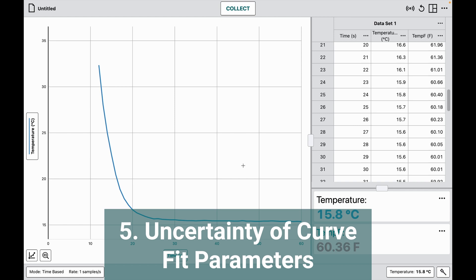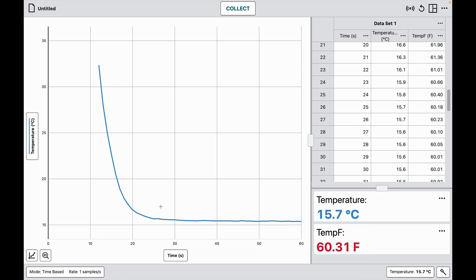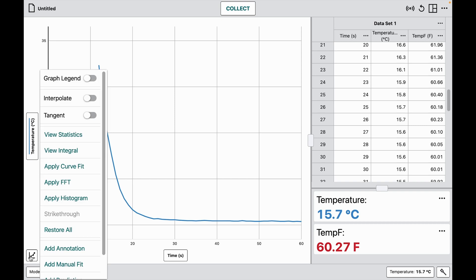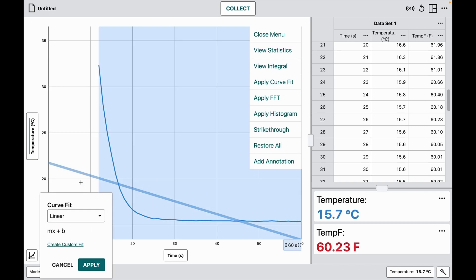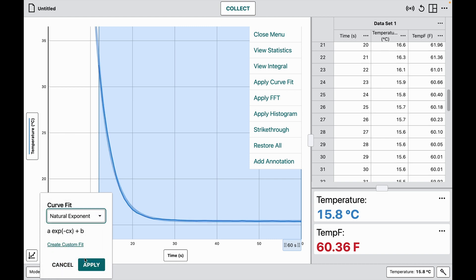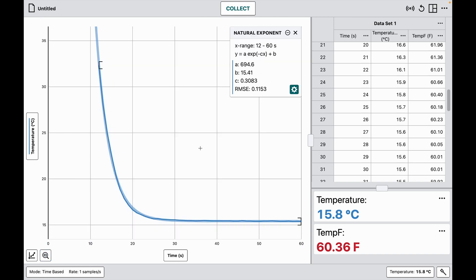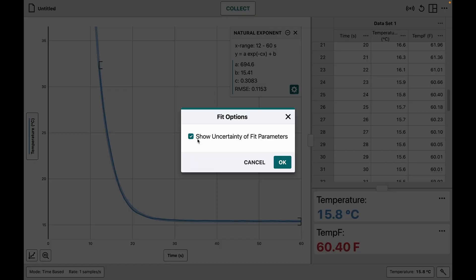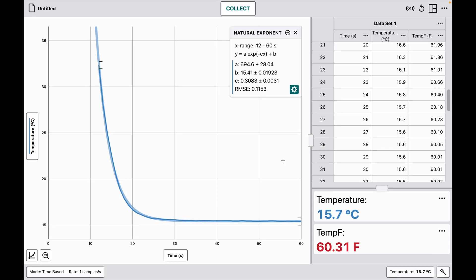Another feature Logger Pro users are used to is showing uncertainty in calculations related to curve fits. Here I have a graph that looks somewhat exponential, so I apply a natural exponent curve fit — which looks like a nice match. To see the error in those coefficients, I use the gear icon on the curve fit output box and choose the option to show uncertainty for those parameters, and I get those values.